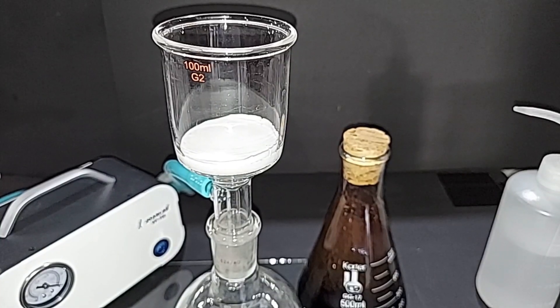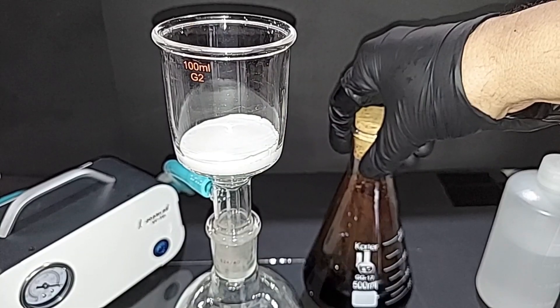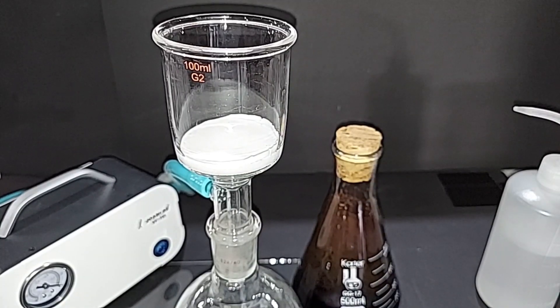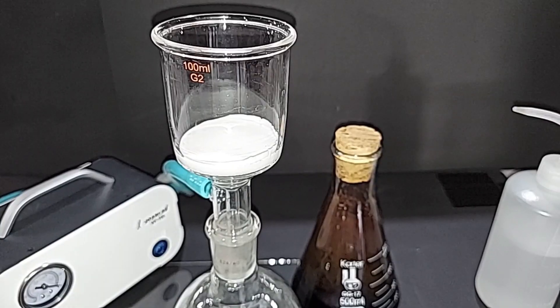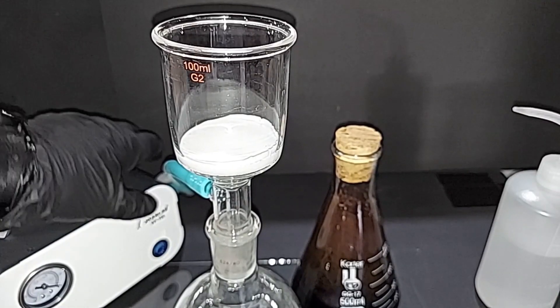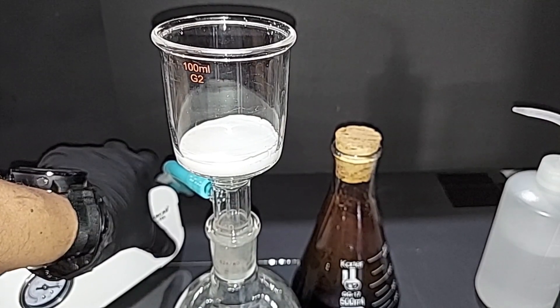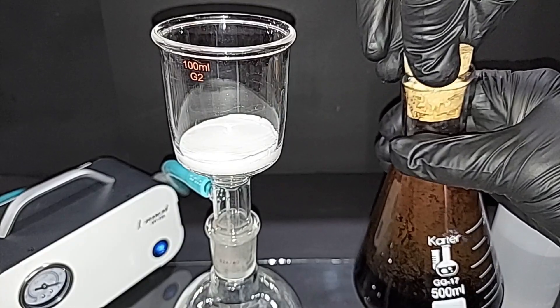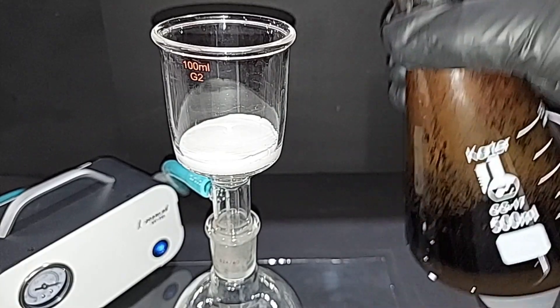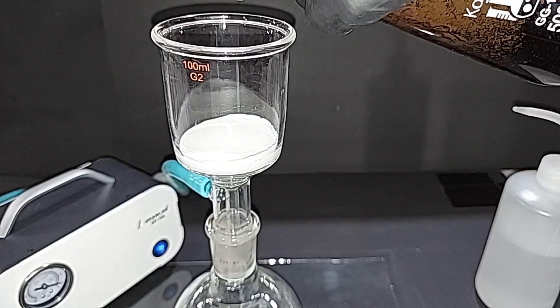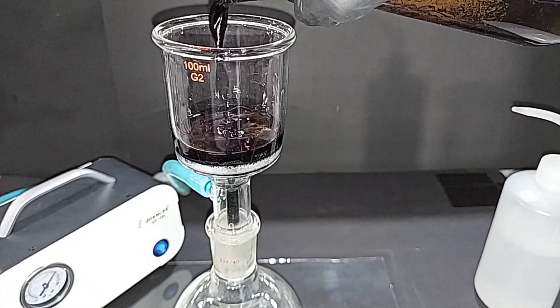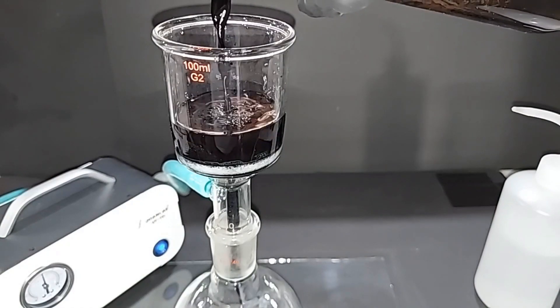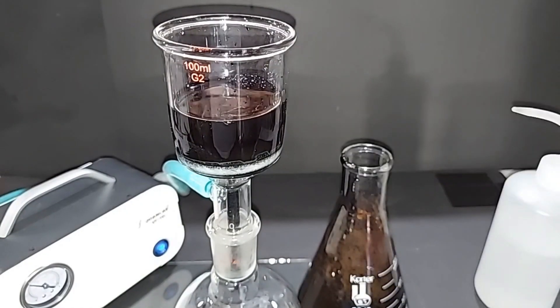I'm all set up here to do the vacuum filtration of the solution, and we're doing this to remove any unreacted manganese dioxide. I do have a very fine filter paper in there. Probably not necessary, but I'm always trying to save the fritted glass as much as I can. See that nice purple color? We're saving the filtrate.